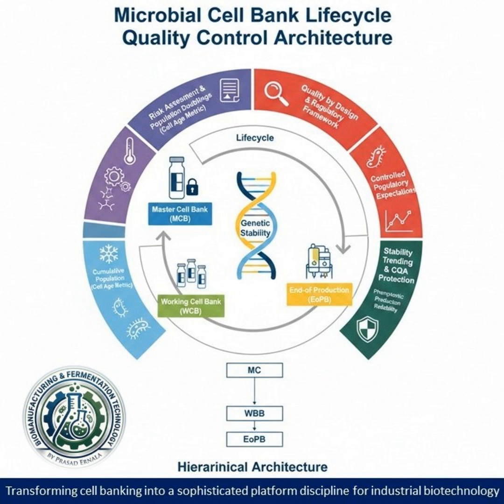That connection between quality and risk brings us to our last area, mapping these parameters directly to the success of large-scale manufacturing. This is where it all comes together. The cell bank attributes are structured by criticality. You have your non-negotiable criticals, identity, sterility, genetic integrity. If those fail, the bank is garbage. But the key attributes like recovery kinetics and growth rate, those are the ones that really dictate if the big bioreactor run will be successful.